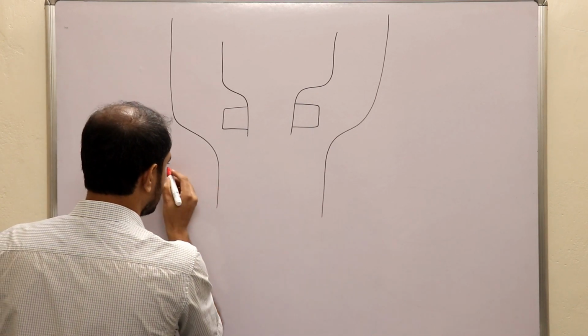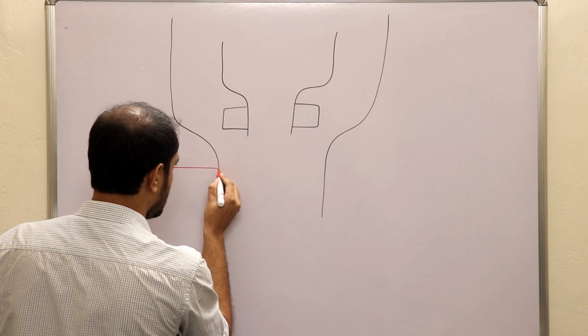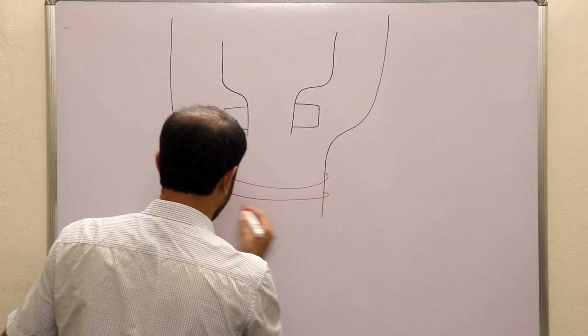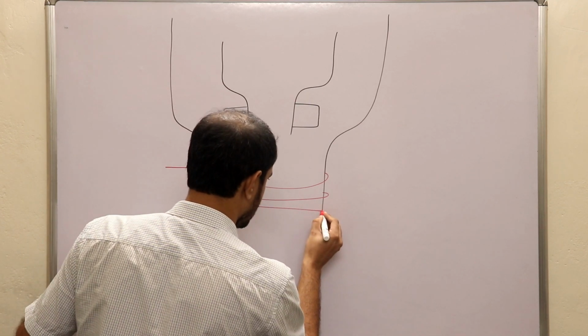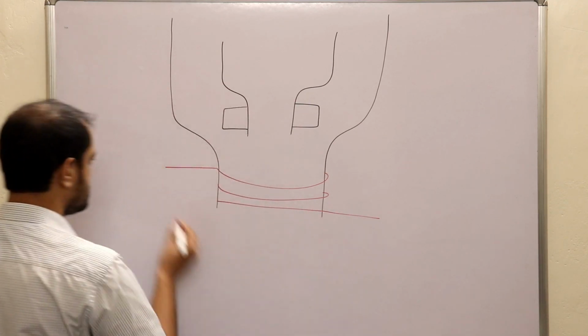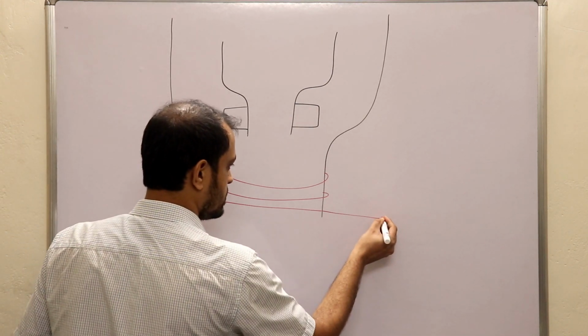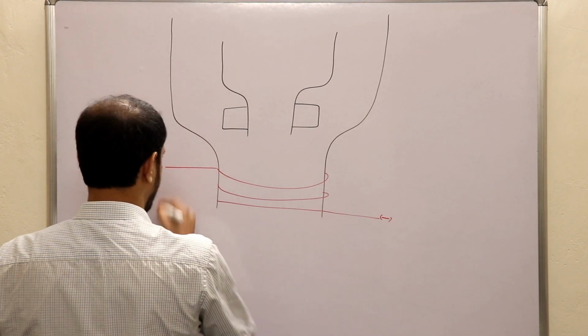You need to understand that this nozzle is actually connected to a wire.